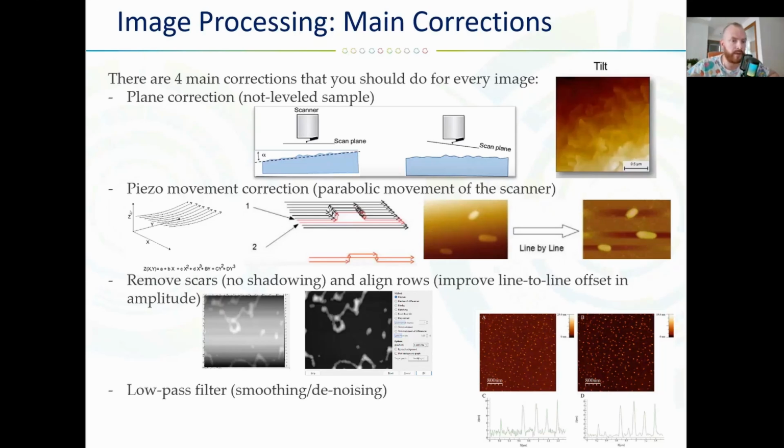But with high frequency noise, as I said, you can cover, or you can do it again by filter. So this is a low pass filter, which allows you to cut high frequency noise. And here you see there is a bit noisy signal, but at the end we flatten all this by removing these high frequencies. And normally high frequencies, what is it? Our voice is also high frequency because it's kilohertz.